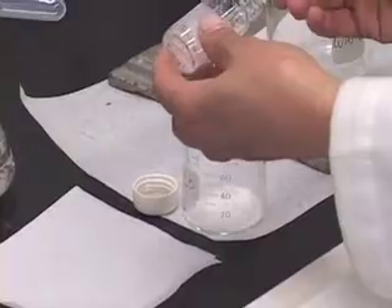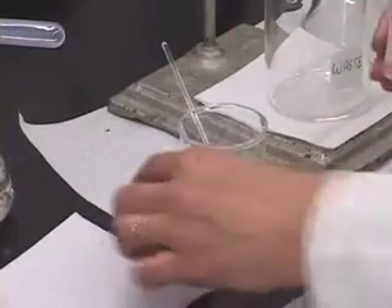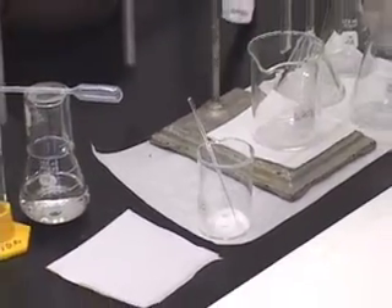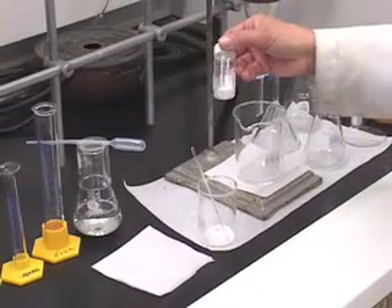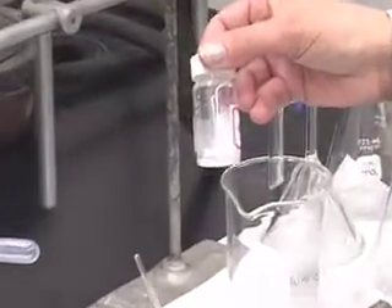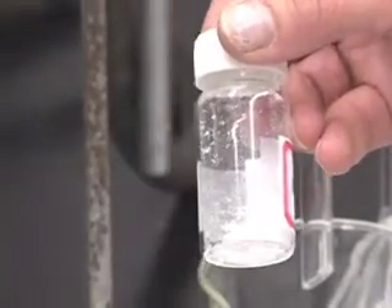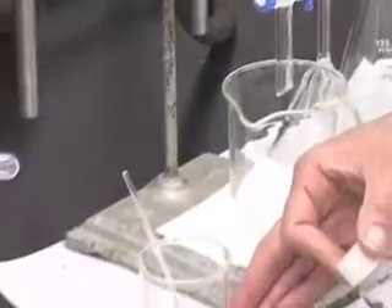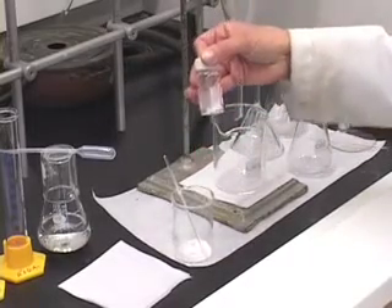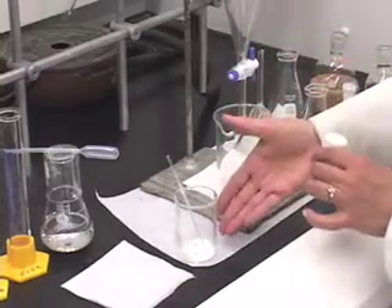If you want to use a glass rod to loosen the crystals, that is fine, but the glass rod has to stay back in the beaker. After transferring the unknown, take this vial back to the balance and re-weigh the empty vial. Notice that this vial is not all that empty — there are some crystals sticking inside. That is okay since we are doing the weight by difference method. We know exactly how much we have taken in the beaker by weighing the vial with the unknown first, and then re-weighing it after transferring. The difference between the two weighings gives you the amount of solid you have taken.